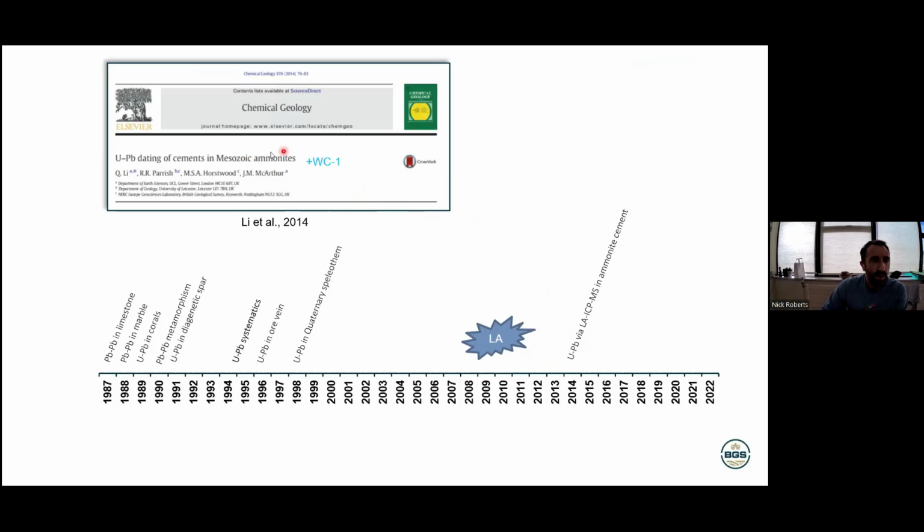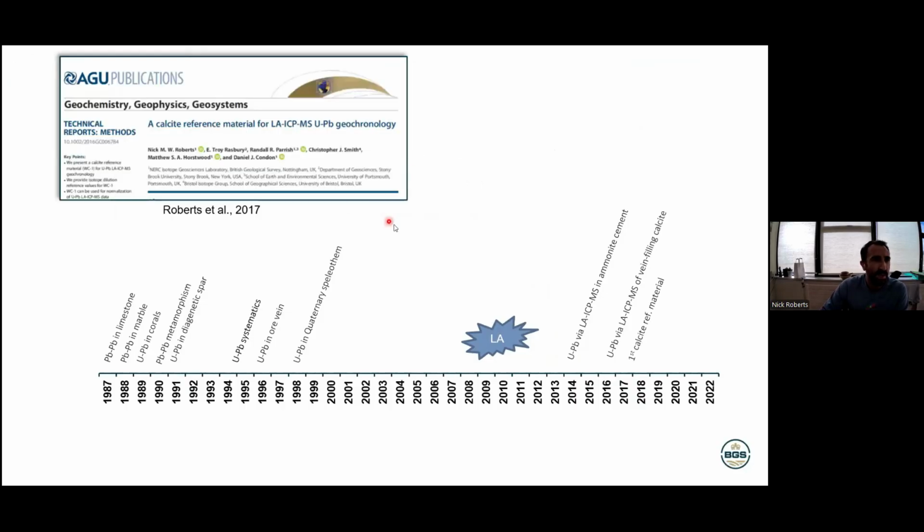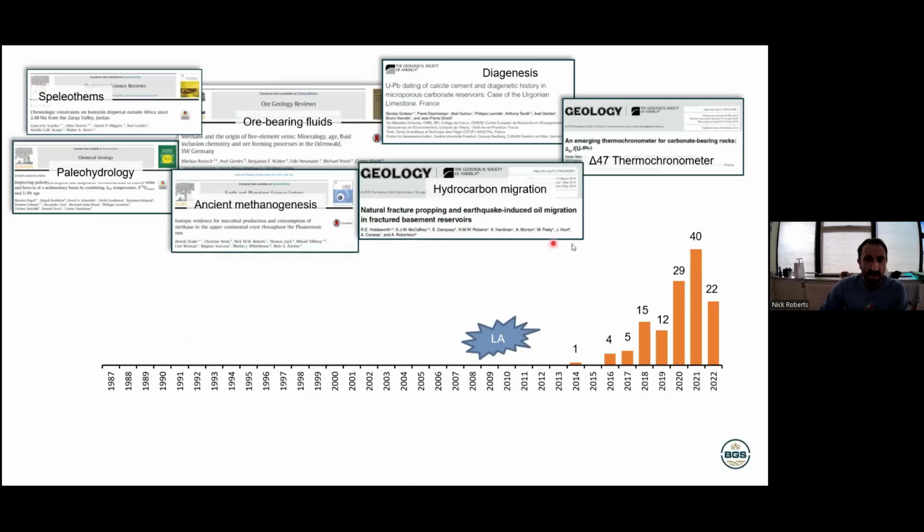We started talking about these methods throughout the early 2010s, and by 2016 we started seeing a tranche of papers coming out using laser ablation. In 2017, we thought we'd better finally get around to publishing something on the standards, the reference material we were using.